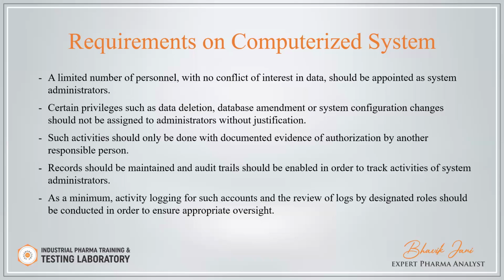Certain privileges such as data deletion, database amendment, or system configuration change should not be assigned to the administrator without justification.